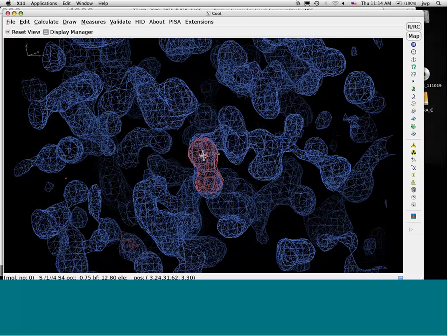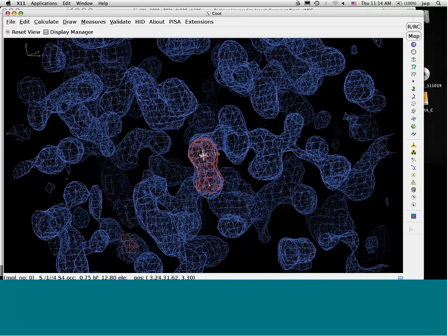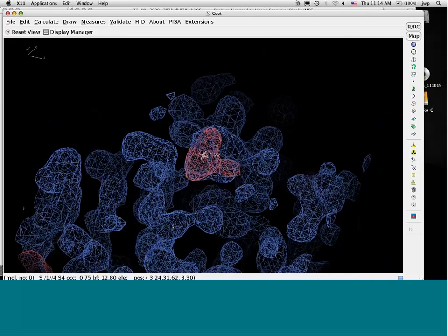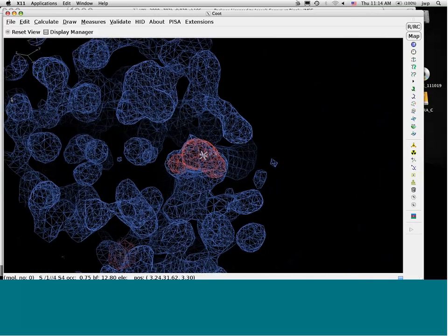And this is actually the results of the thaumatin that I wanted to just touch on for a second. And what you see here, here's a peanut shape. SHELXD did not find this other sulfur. It just found the one sulfur there. Here, for this disulfide, it found both sulfurs. Here's a case of a methionine that's disordered, actually.